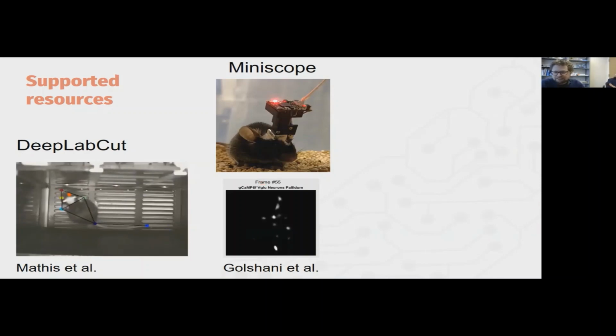Okay, a couple of questions. First of all, Andrew, thank you for replying more to Natalie. Mike Meshes asks, how big is the field of view typically for the Miniscope?